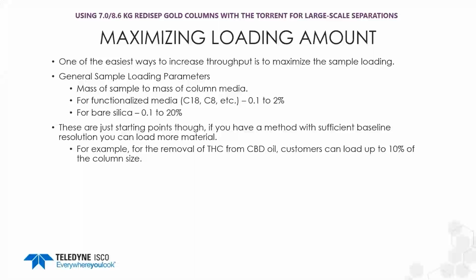But the nature of their purification is that they're just removing THC from the CBD oil. They don't need high resolution. They don't mind the other impurities with the CBD, but the THC needs to be removed.